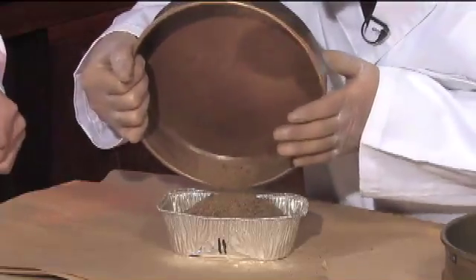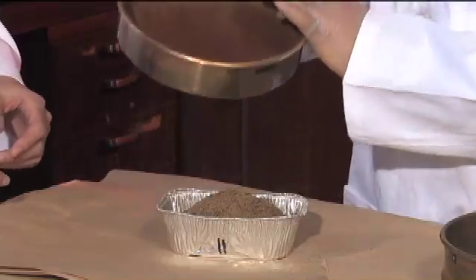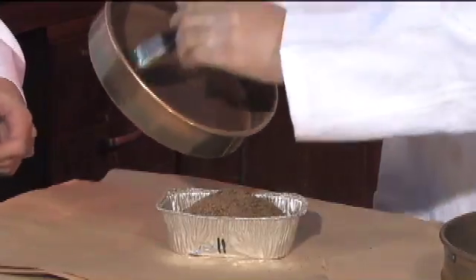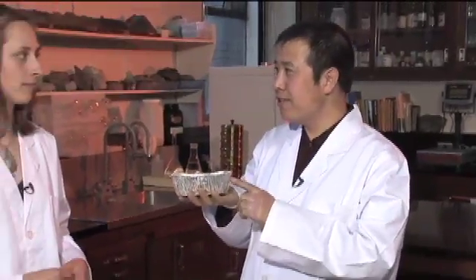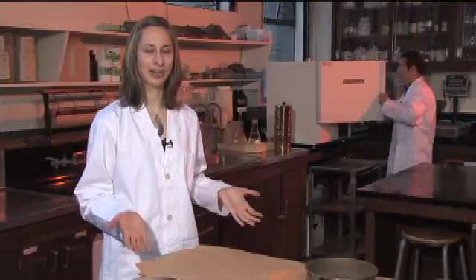Gently pour all the fine material out, trying to minimize the dust. Now put this fine material with the tin in the oven and let it stay there for 18 to 24 hours at 105 degrees Celsius. All the fines are going into the oven to dry overnight, and that will give us a constant weight value.